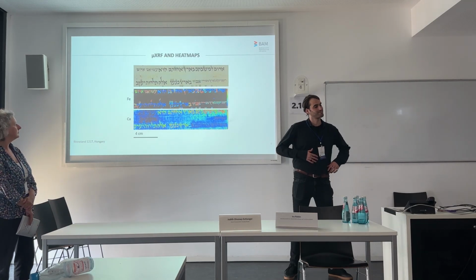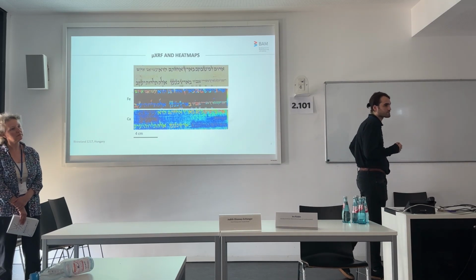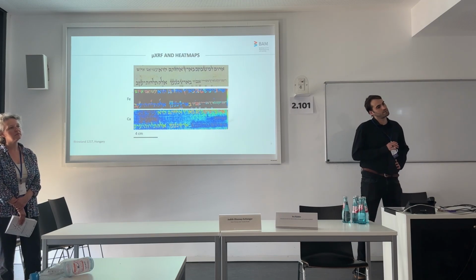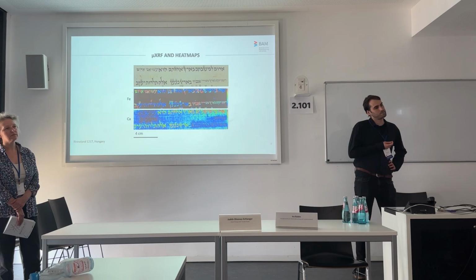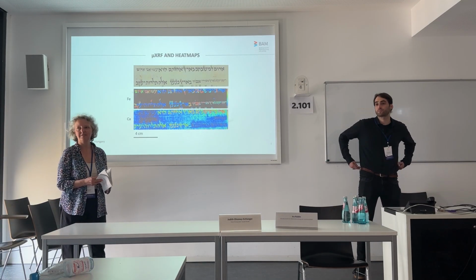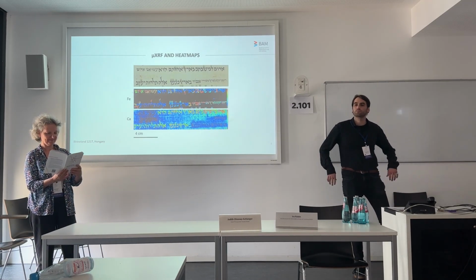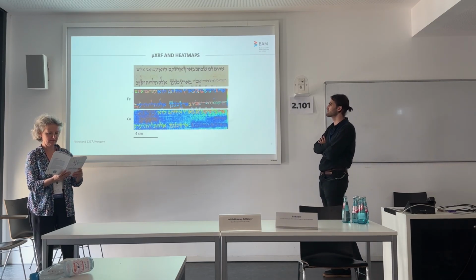This is exactly the point: you have suddenly a very thin ink. If it is the same ink, it would be written in the same type of ink. It would be even colder in color because you have less iron there. However, if you take ink that naturally has much more iron, that's what you see, and it cannot be done at the same time. It's a different ink. And in this case, what the correction is, they're changing a closed section to an open section. So this has to do with the dissemination of Maimonides' lists and all that.